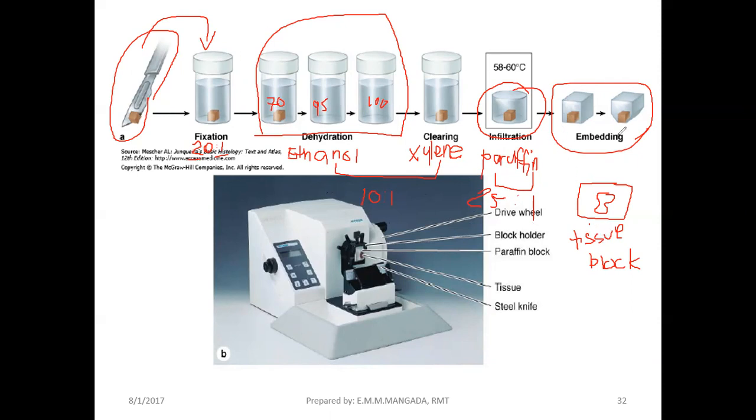And then after that, we have the embedding or also known as your casting. Cast. Cast lang malakas. Joke. Ay casting. Hindi cast College of Allied Health Sciences. Eh di casting. Yan, casting or your embedding. Again, the medium used for embedding is also paraffin wax. Commonly used medium is paraffin wax. So tandaan ninyo, the medium that we use for embedding is the same as the medium we use sa infiltration or impregnation.